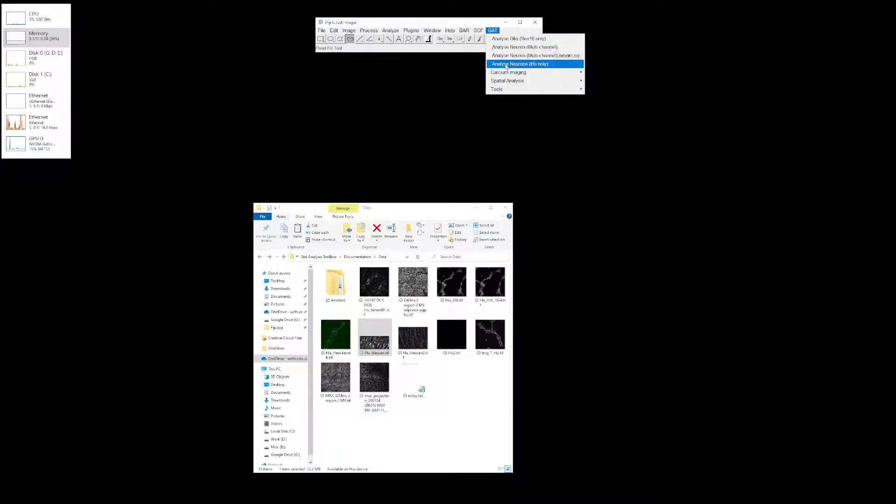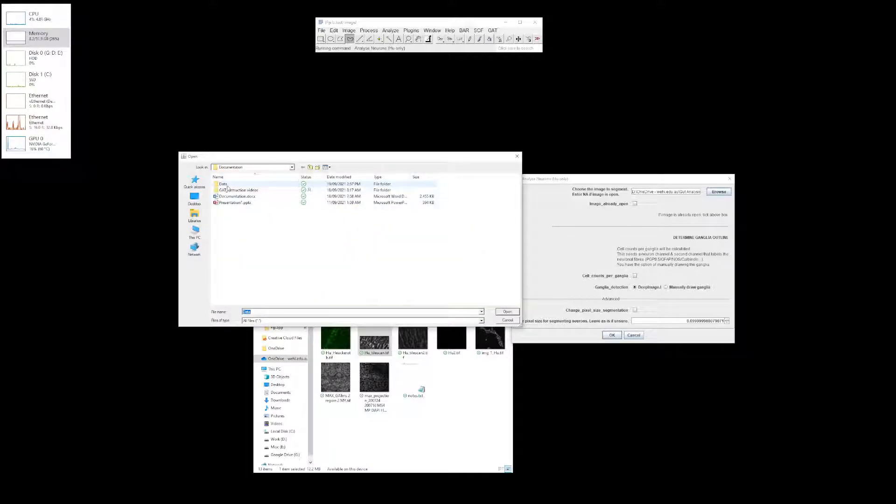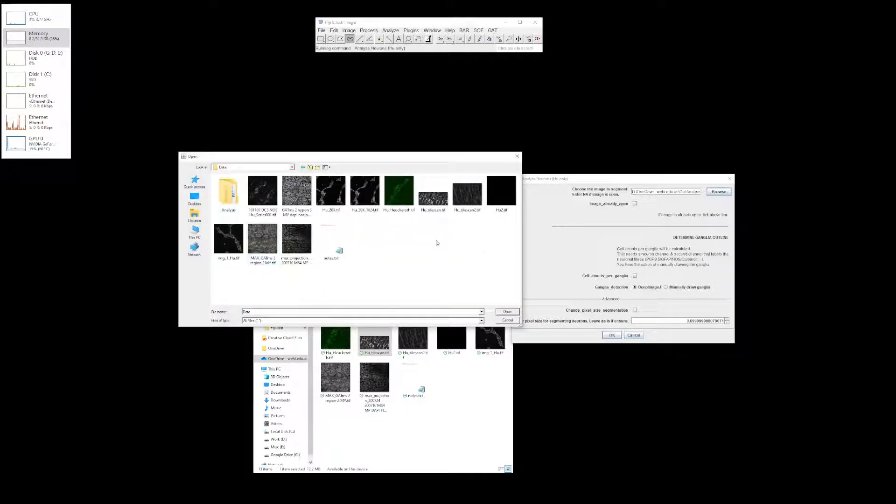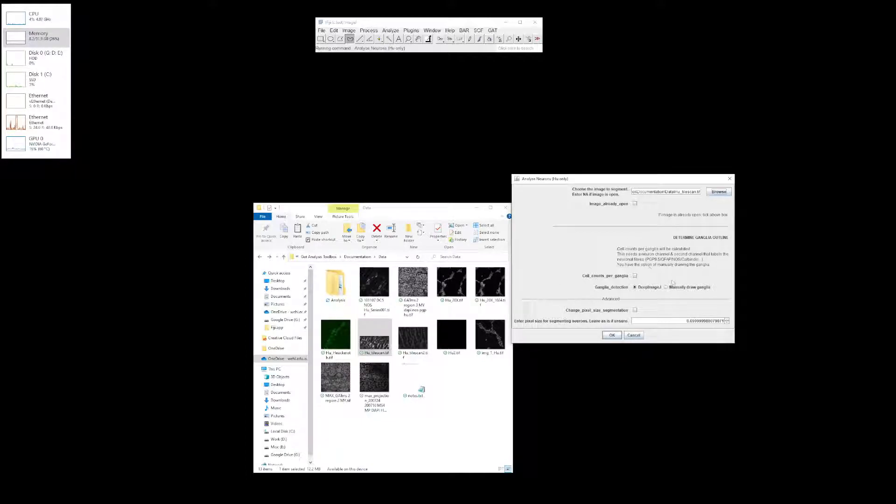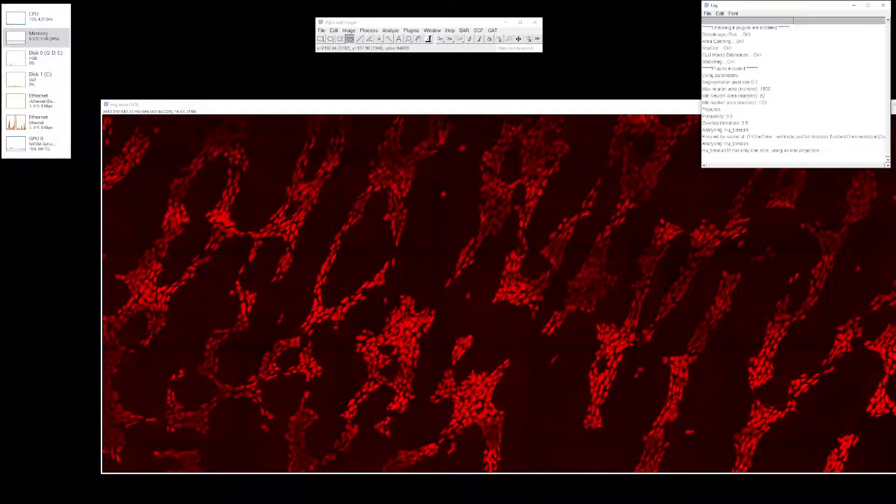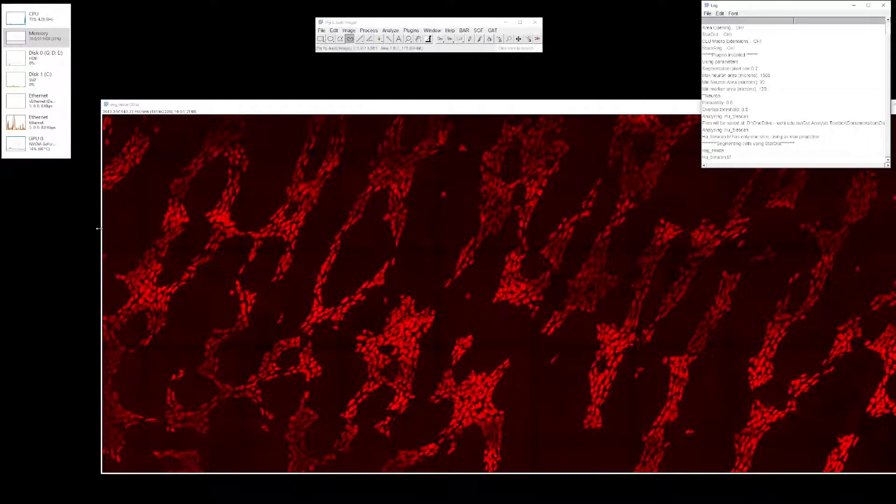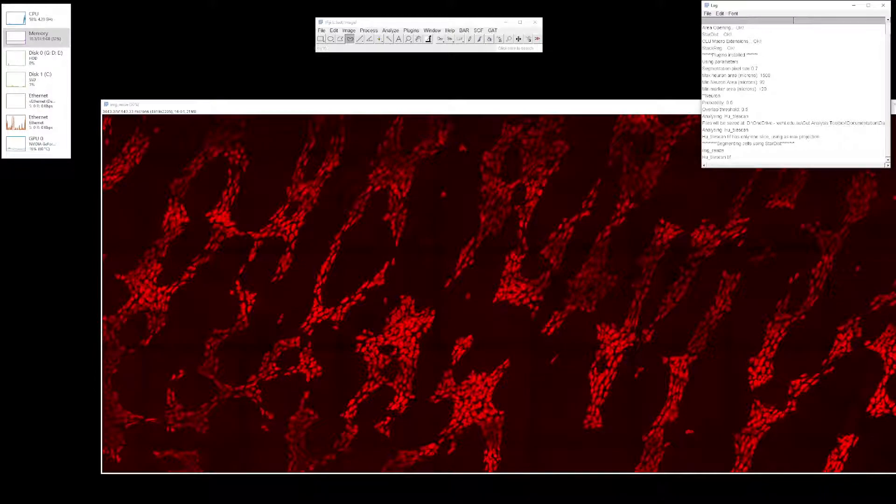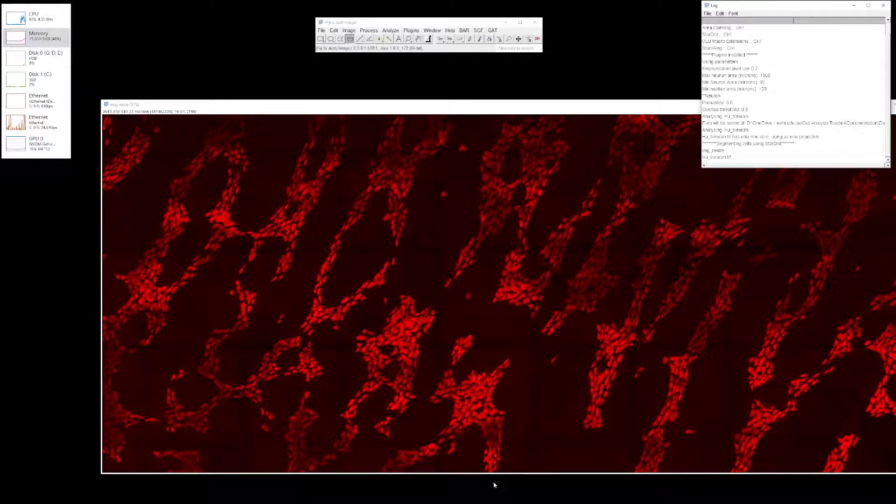Close this image, hit GATT and go through the same procedure again. Analyze neurons, select the tile scan image. Keep the raster settings the same because if you're not sure of the raster settings, just keep it as is. Click OK. Now it's opened the image and running segmentation. One key thing to notice: if you have really big tile scans, the RAM consumption does go up, so just be mindful of that. The time it takes depends on how powerful the computer is.